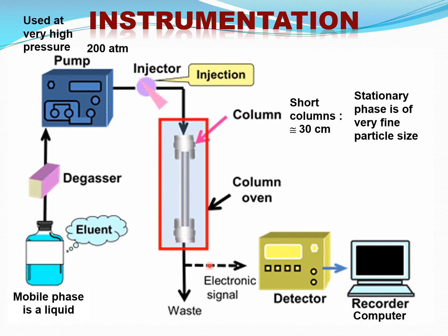Then here you have a detector. Detector will detect the compound that comes out. It will measure the amount that is transferred to the computer. Computer generates the chromatogram, just like in GC.